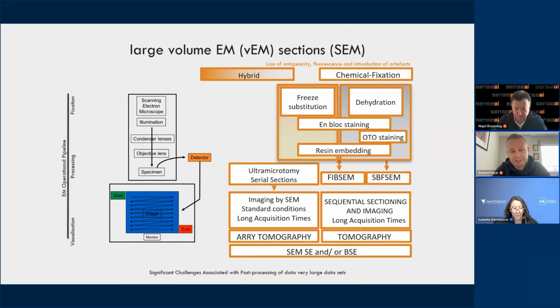to vitrify the sample in this way that is essentially perfectly preserved in its native biological state, and then we image it inside a cryo-vEM and you sequentially build up a large number of sections and then reassemble them in silico. So all of these techniques are quite challenging.